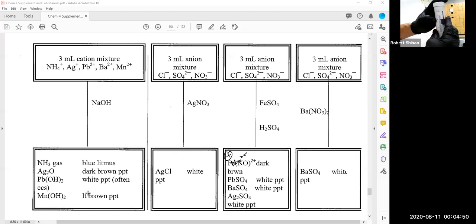I want about 2 milliliters of concentrated sulfuric acid, and then I'll set it. I have a little less, but it doesn't matter. The amounts need not be exact. Now, when we add acids, it gets very hot, so I don't want to hold the test tube with my fingers. I'm going to use a test tube clamp to hold my test tube so I don't burn it.